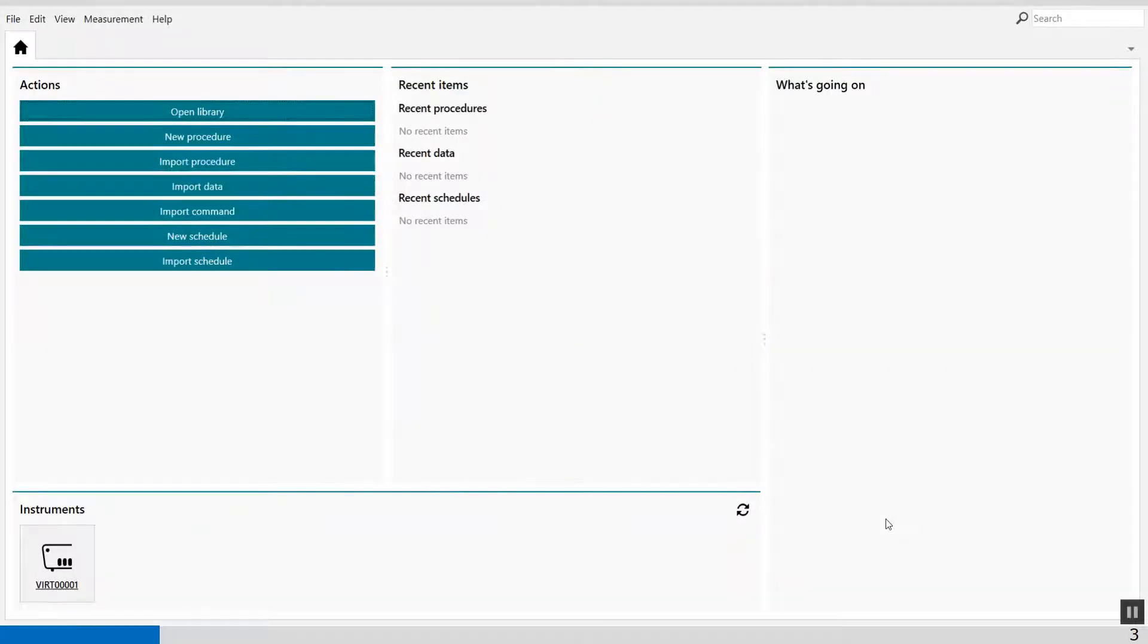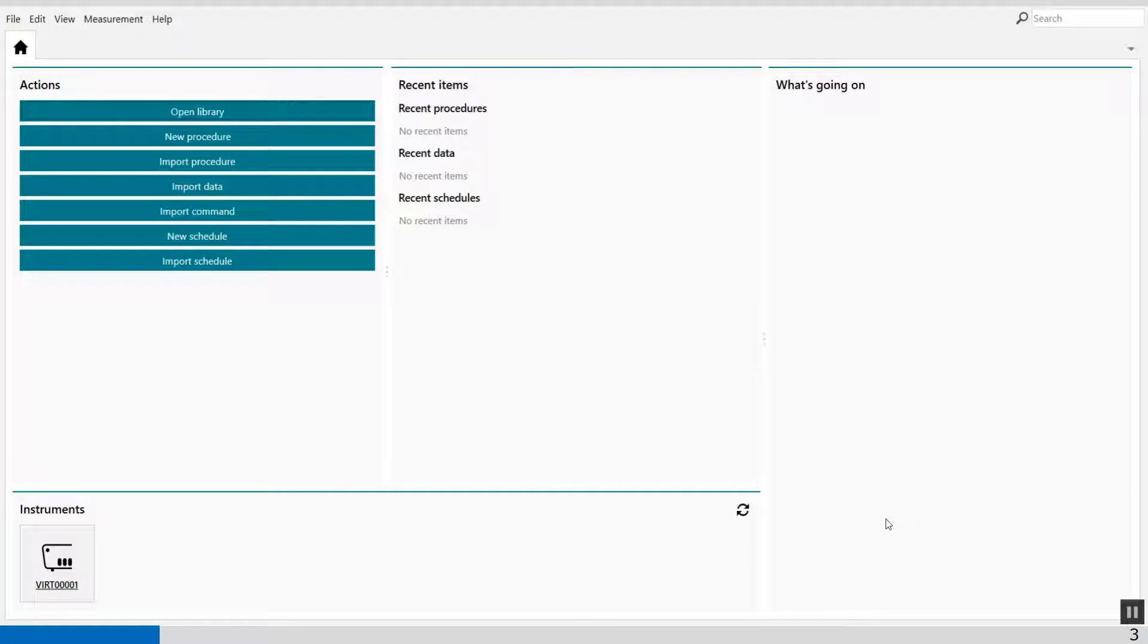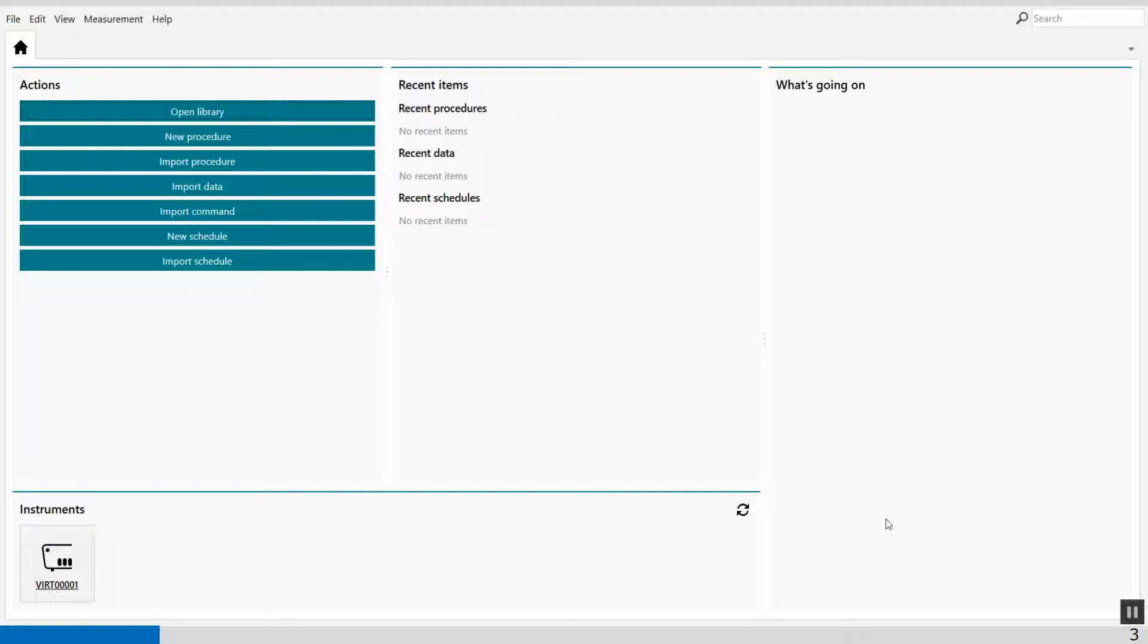Welcome to NOVA software. Data points recorded during an experiment are saved in a user-defined database as individual NOx files. However, for some applications, it's convenient to be able to perform calculations using data points from two datasets.